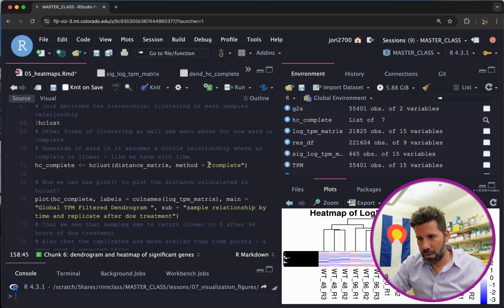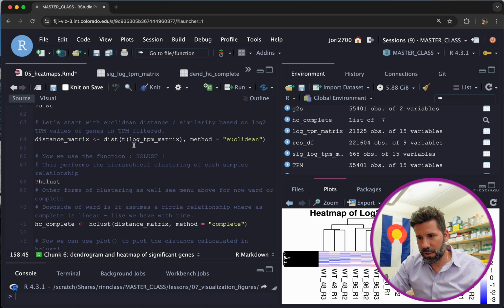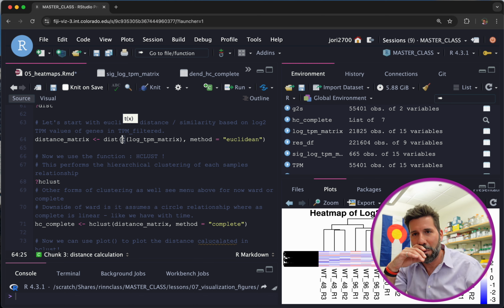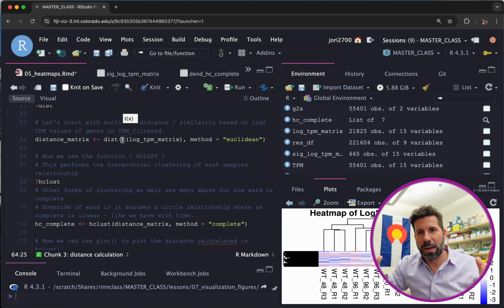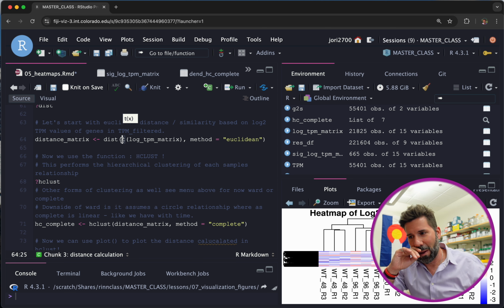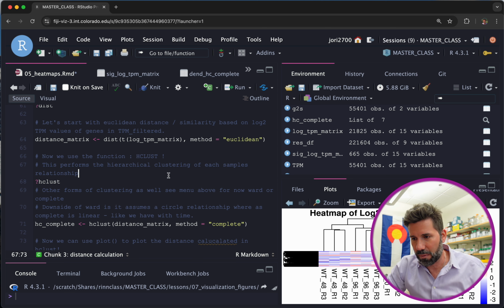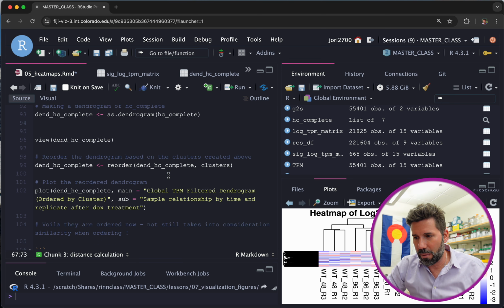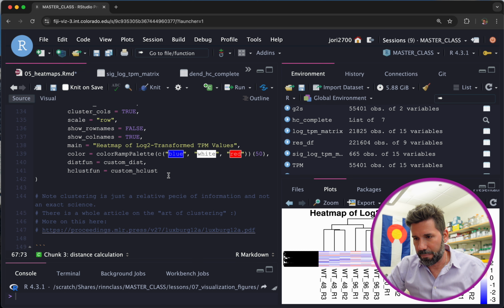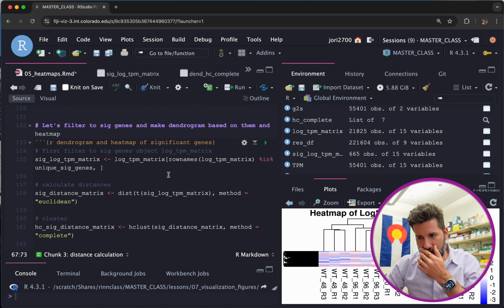And so, yeah, we just did. Oh, we did. Okay. So, just know that you have to do that. You have to take the column and turn it sideways, basically. So you're actually going to take all the values of that column, turn it into a row, do the comparisons, and then it will give you those distance comparisons in that funky type of table we looked at. So just remember, you have to do that t to do the clustering and getting the distance.